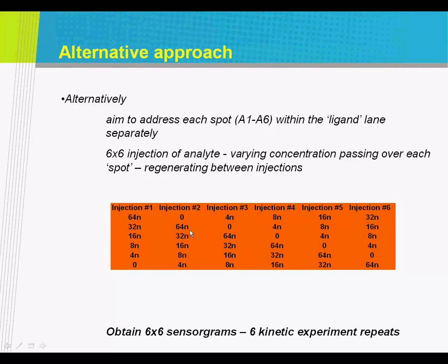And in this case, it's around about 1.9. Well, on average 1.8. That is for 10 to the 5, and the Kd dissociation rate is still about the same. So either way you do it, this is one way you can troubleshoot if you end up with a differentially immobilized channel. Right, and that's it.